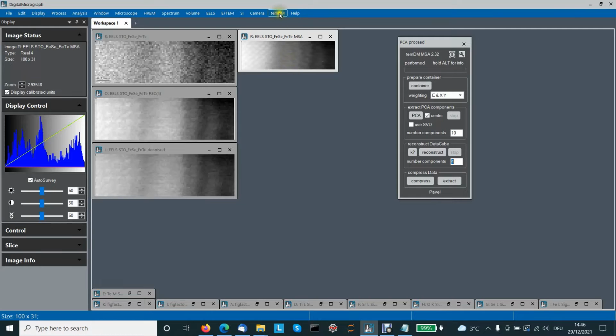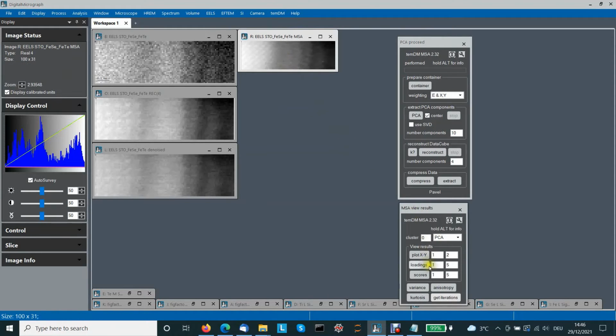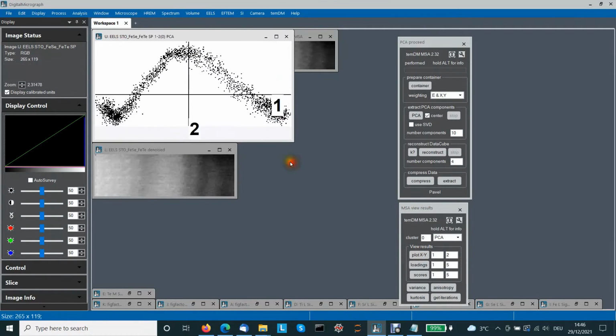What I mean is, if we look more deeply into our PCA results, we will use the View Result tool, and we can plot the data distribution between the first and second principal components. Here we are. First principal axis, second principal axis, data distribution. And, well, we see some data trends.